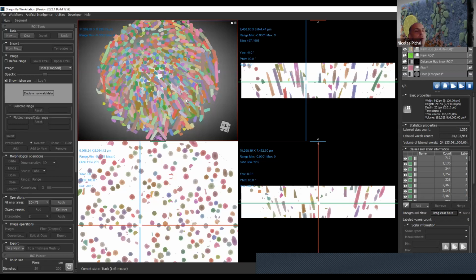But the real problem is that sometimes it's very tough to separate the objects. In fact, what you do is multiple separation. So you detect in a way which are not separated. You classify. You use our classification module to separate them, and after that, you do a watershed just on them, or something like that. We're working on deep learning type of separation of objects, but in 3D it's kind of tough. Also, the training data for that can be tough. But stay tuned. We will have more stuff to show at that level.